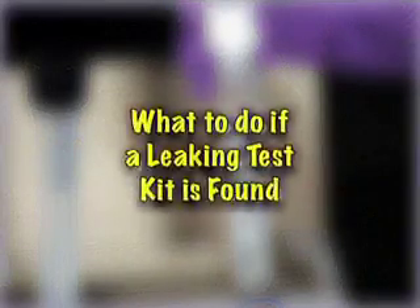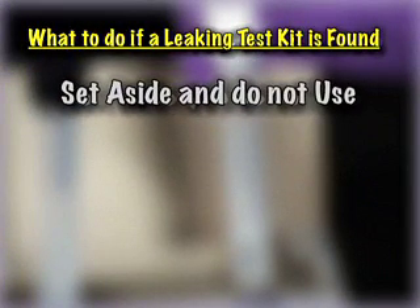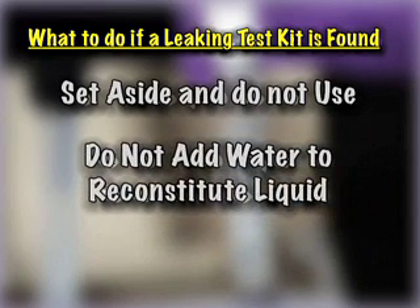What to do if a leaking test kit is found: If a leaking kit is found, it should be set aside and not used. Using a kit that does not have the proper amount of buffer solution can cause false positive results. Do not add water to reconstitute the liquid. The free liquid is a controlled buffer solution with precisely measured amounts of active ingredients designed for that particular test.